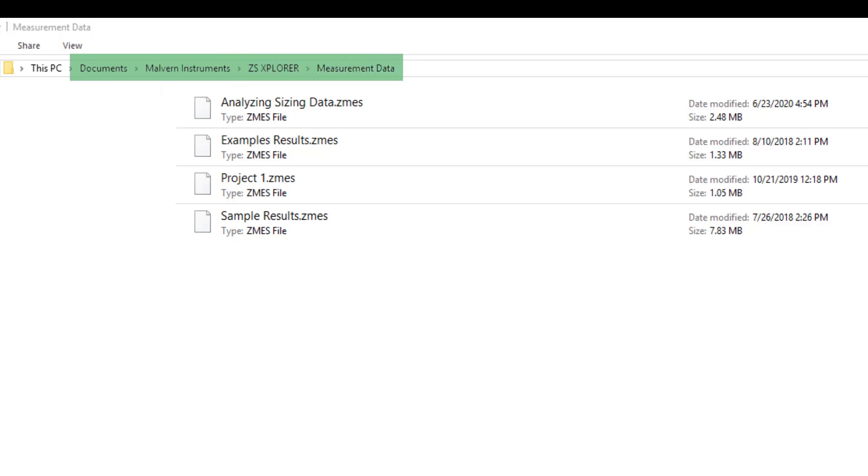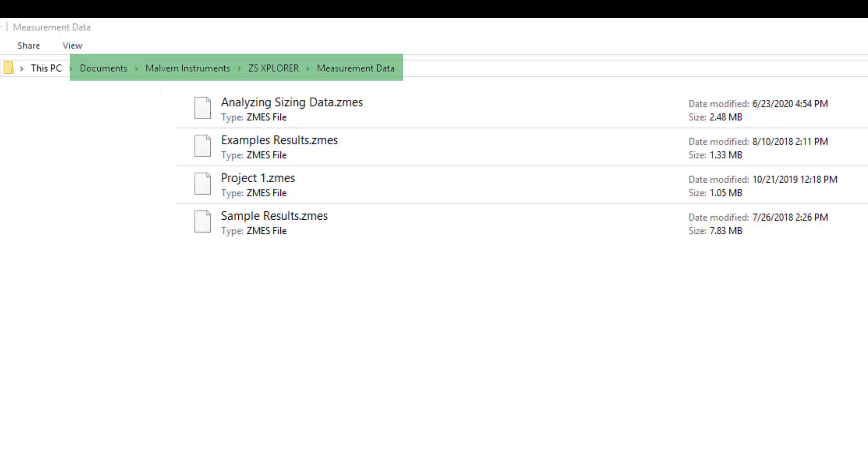You will want to save a copy of the exported .zmes file in this location. Once you do this, you can open the software to find it in the Project Explorer.